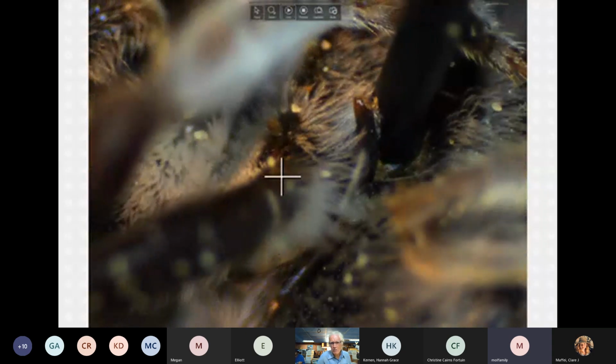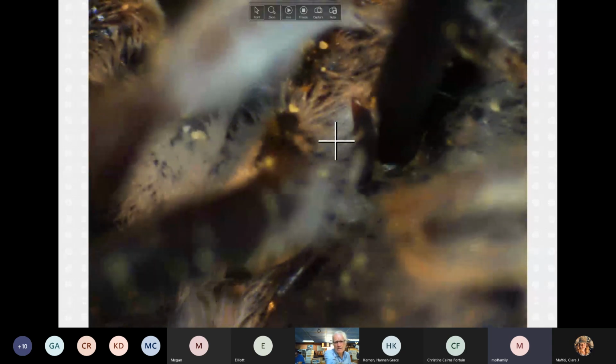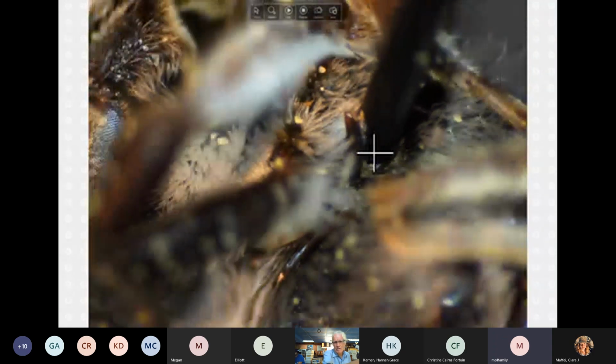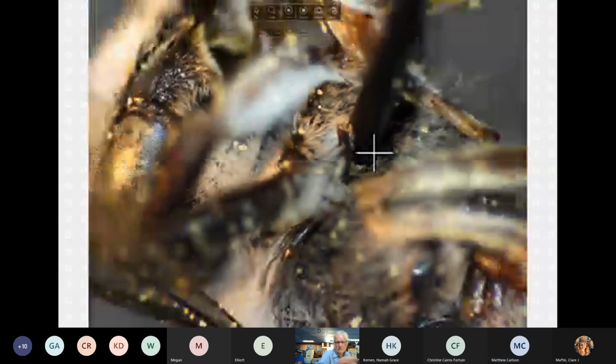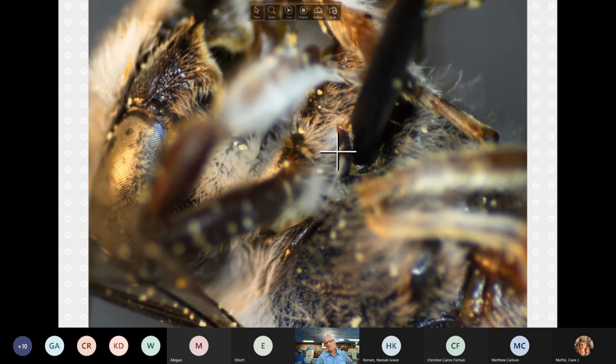Or a very low bump, and that possibly is the little tubercle at the top. It could be, but it's nowhere near that dramatic size. So I think this is the kind of thing you see: if we were looking at something completely flat, that definitely has projecting up above the surface. But in this particular case, in comparison to the other species, it's quite low.